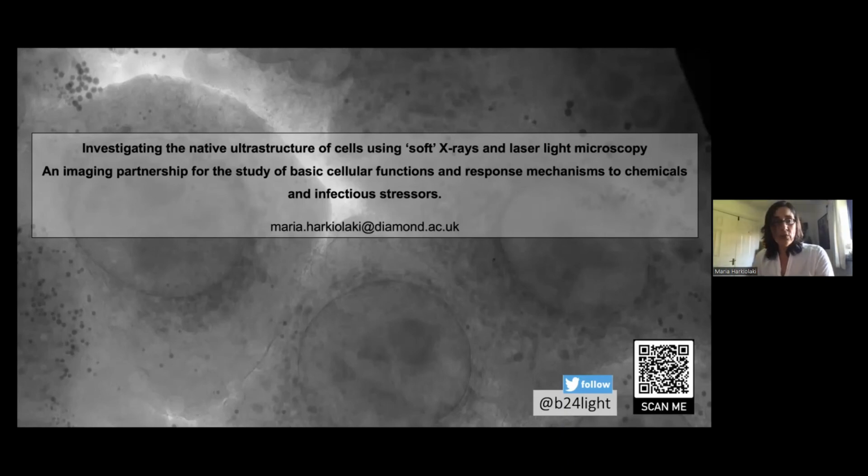We do use an awful lot of cell membrane permeable dyes if we want to label mitochondria, lysosomes and the like. And that is basically for localization and identification purposes, not contrasting. Okay, I can see that.